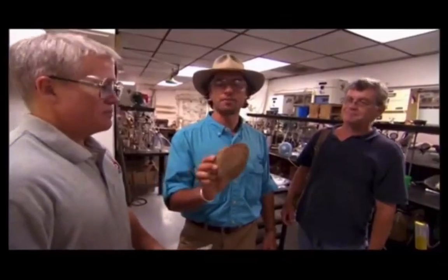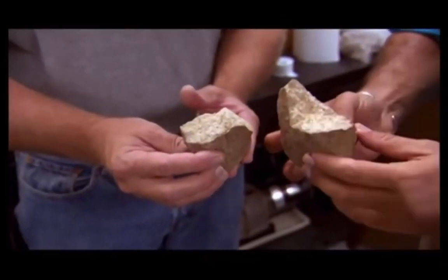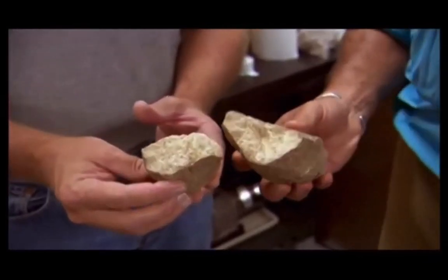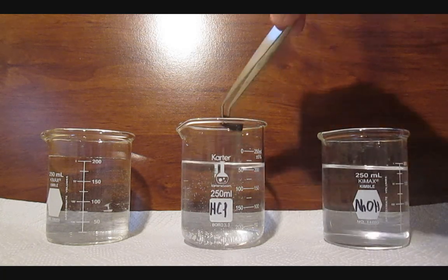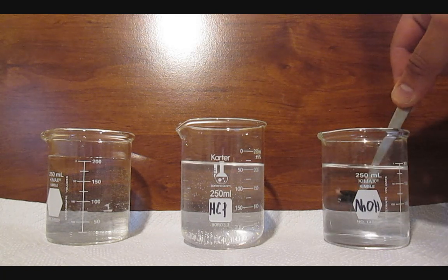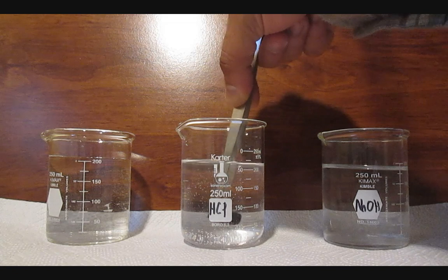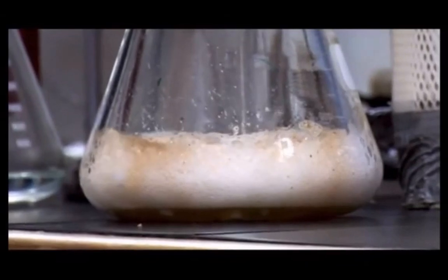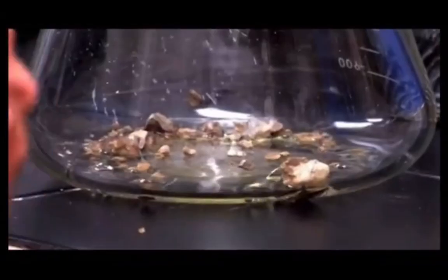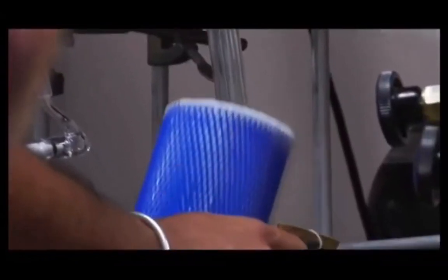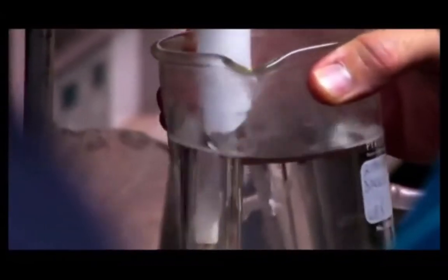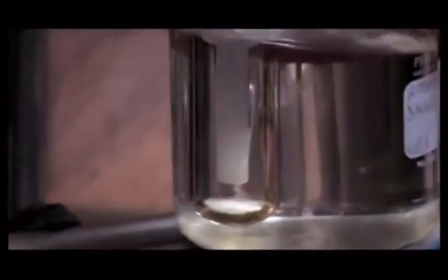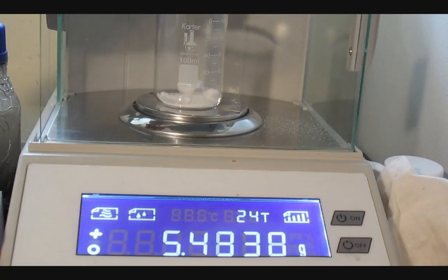The candidate sample must be collected observing strict rules to not introduce modern carbon. This includes washing with hydrochloric acid to eliminate carbonate, sodium hydroxide for fungi and bacteria, and again, hydrochloric acid because sodium hydroxide could contain carbonate in trace amounts. Normally the sample is then burned in oxygen and the carbon dioxide collected is reacted with lithium metal to produce lithium carbide which releases acetylene when dissolved in water. This gas can then condense into a cycle of benzene in the presence of a catalyst.